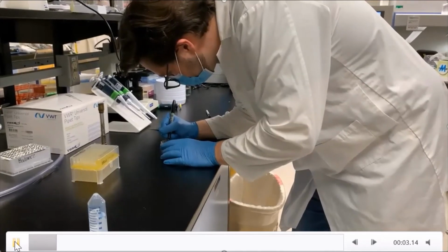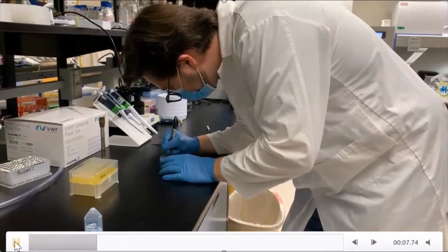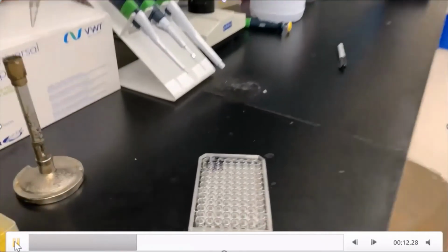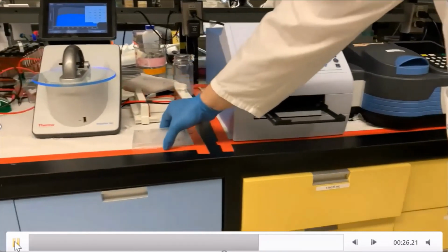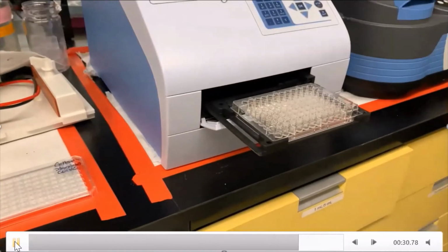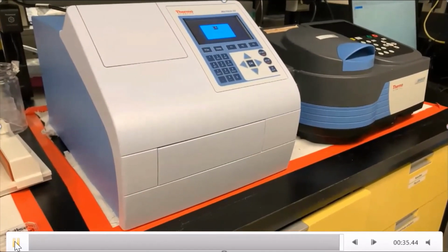Here, after you've done all your hard work, you want to remember to label your plate. Make sure you do this so that nobody throws it away when you're in the lab, losing all your hard work. Then we'll be measuring the absorbance of our 96-well plate in our absorbance reader. It's computer controlled, so you want to open the reader and then you'll insert your plate. When you insert your plate, make sure you remove the lid because that could also interfere with the absorbance readings. And then close it, get your absorbance readings, and then you have your data which you can make your conclusions based off of.